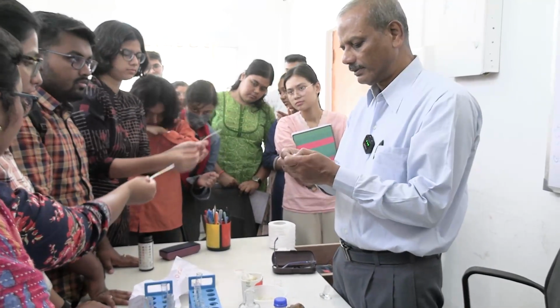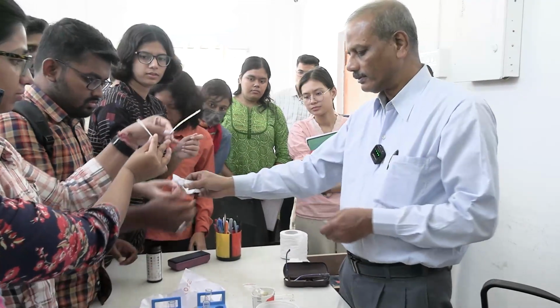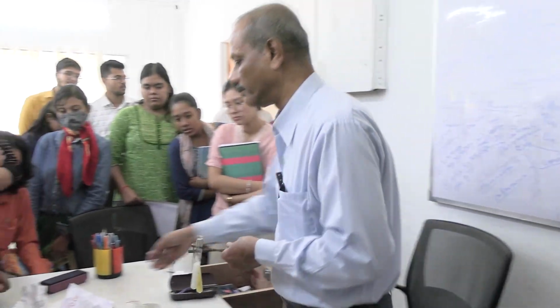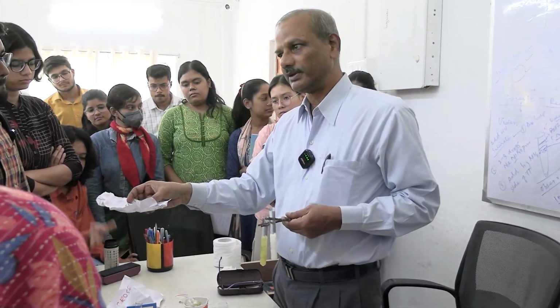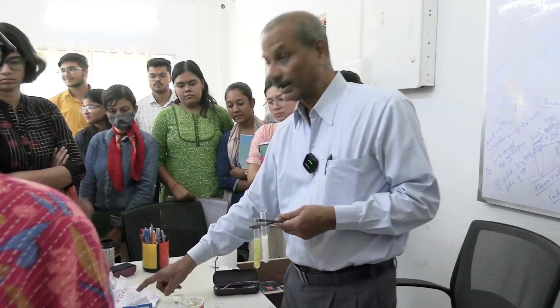Now, open it. Open it. Don't mix it. This is ordinary sugar which I have brought from my room. This is taken normally with tea. I told you there might be an admixture. You might get a positive result, you might not. But here you will not get.